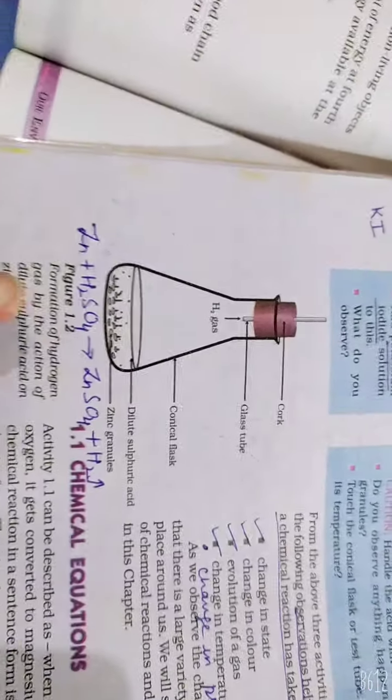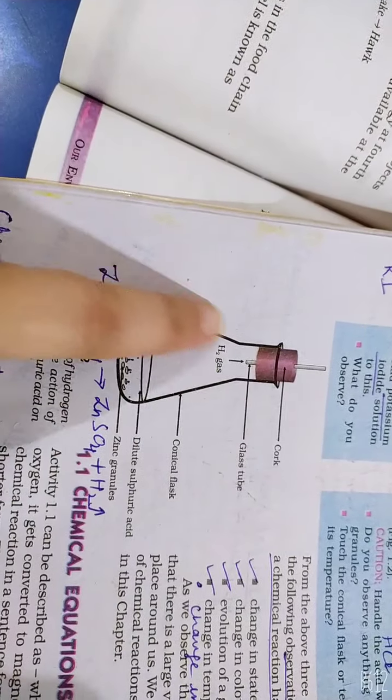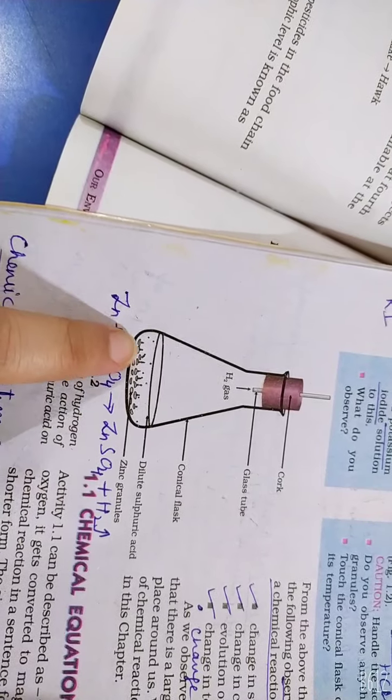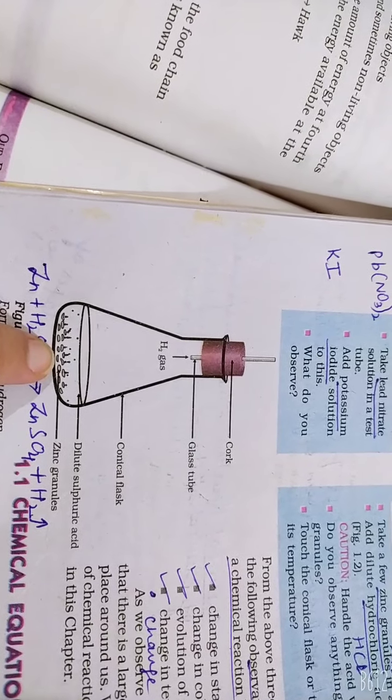This is a conical flask. It is cone-shaped. In a conical flask, we have to use zinc granules.